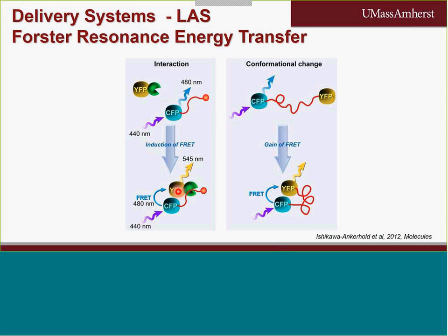This also happens when you are having a conformational change. You have a donor and an acceptor far from each other in the same, for example, protein. Once you change characteristics of the environment, let's say, for example, checking the pH or the acidity of the solution, and they come close together, now FRET can occur.